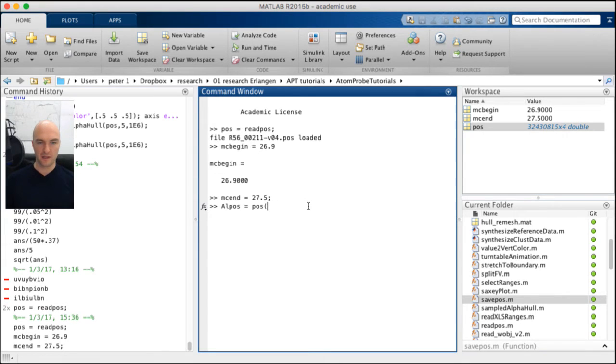So we'll do selection for the rows, which means here we'll need to say we want the 4th column. Okay, so what we're doing now is actually creating a logical variable in this entry, and that logical variable determines which entries from POS we're actually selecting.